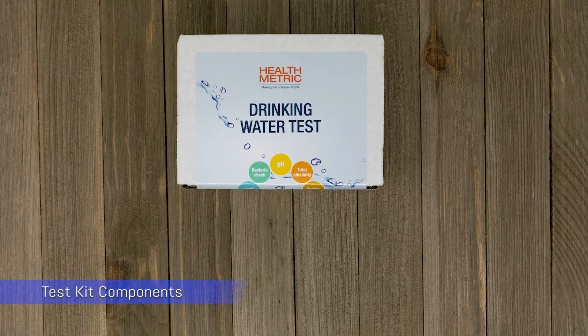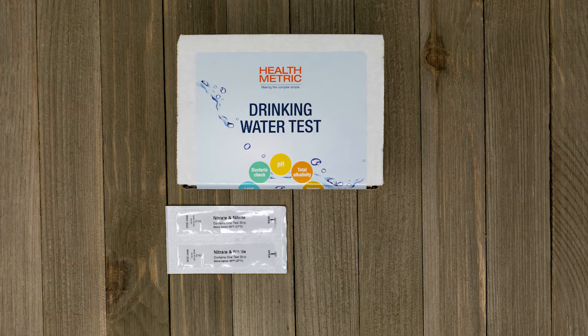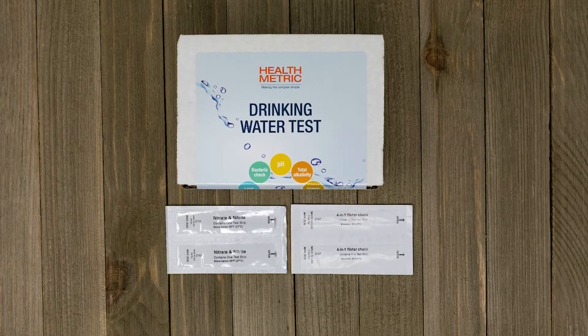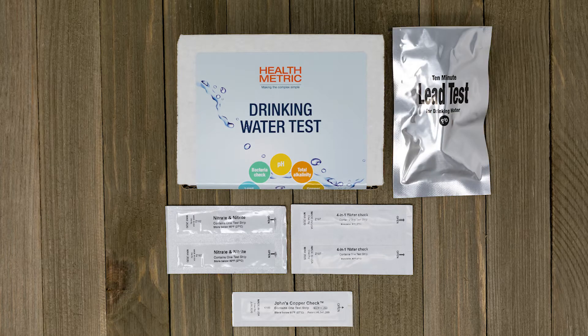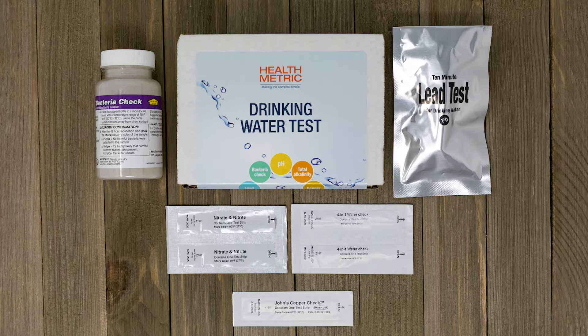The HealthMetric Drinking Water Test Kit contains two nitrate-nitrite tests, two four-in-one tests, one copper test, one lead test, and one bacteria test.